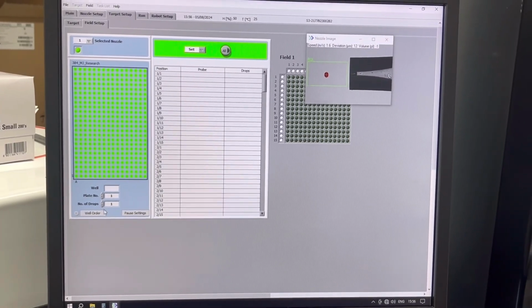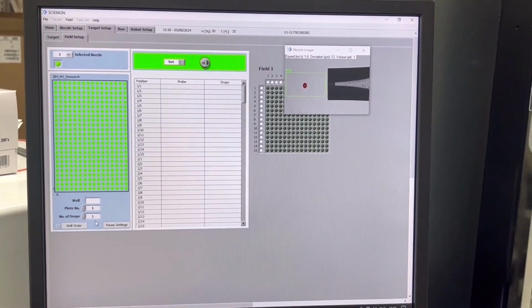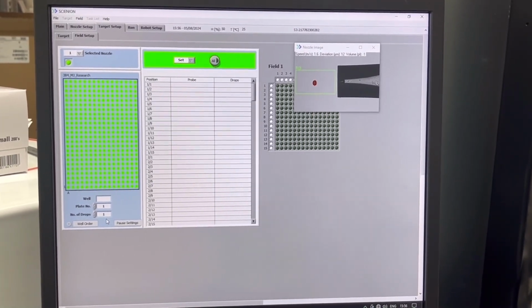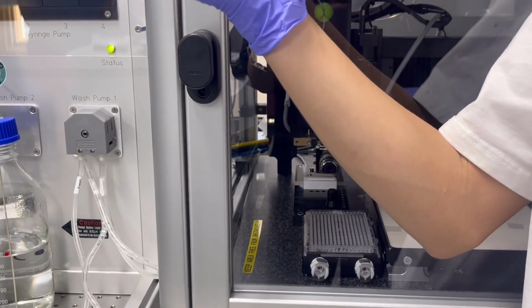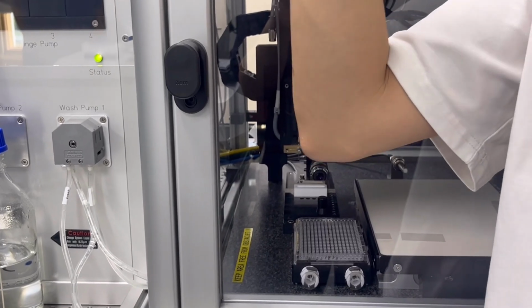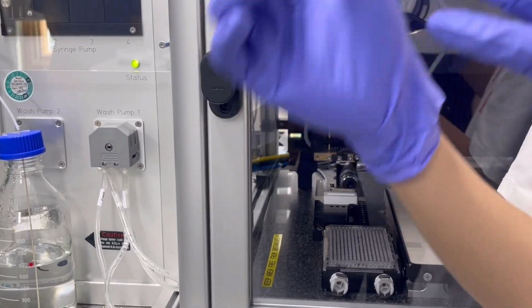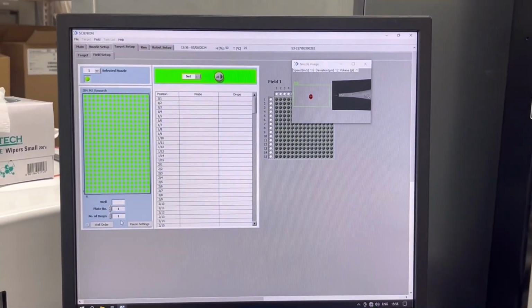But in my experience, I always use one drop. And the more important thing is the concentration. Yeah. Like if we want to see the spot more clear, we have to use the higher concentration. But when we use the higher concentration, it means the more amount of the DNA. Yeah. So we have to understand what we are doing to choose how many drops we need to use.